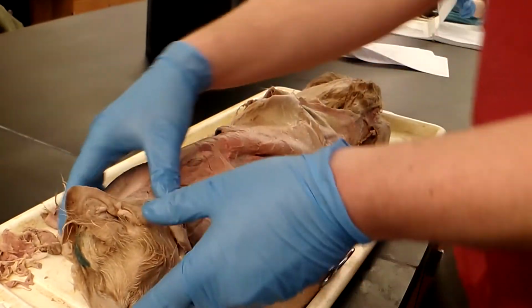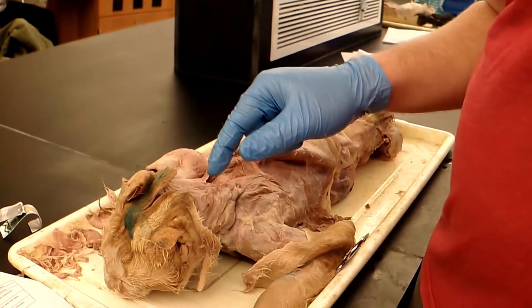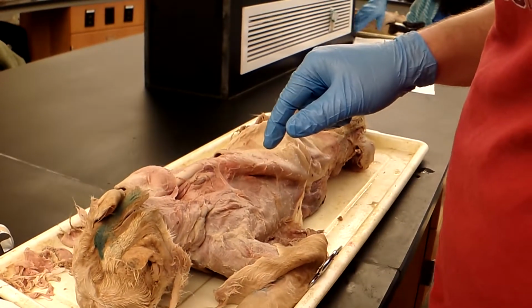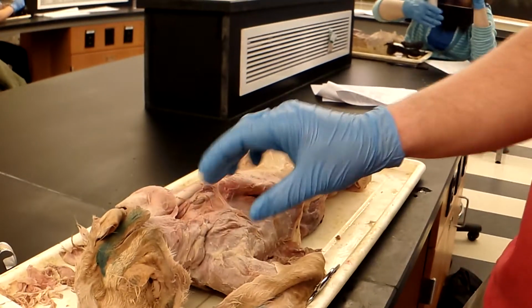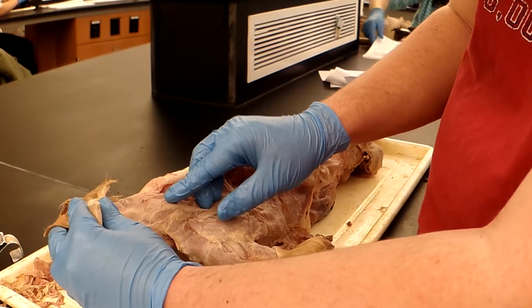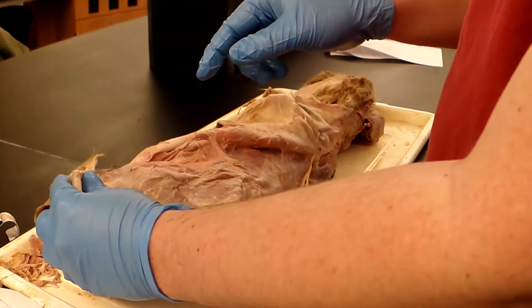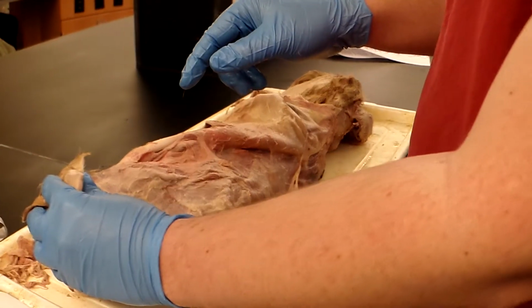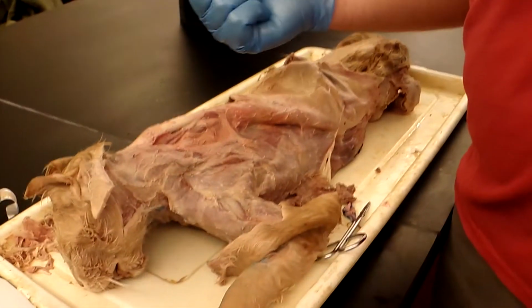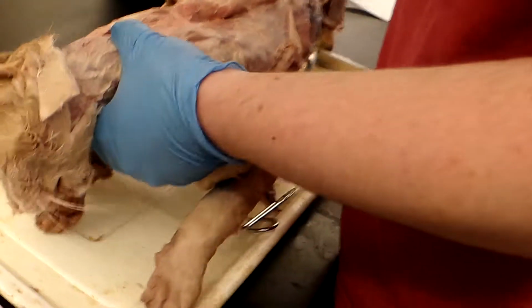Moving on to the neck musculature. The sternomastoid is located right about here. The origin is the manubrium, the insertion is the occipital, and the function is that it rotates and depresses the head. Next is the cleidomastoid, which, flip the cat over.